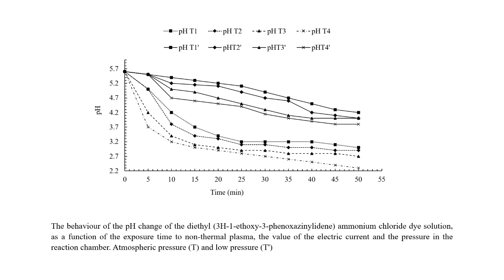The difference in the minimum pH value reached for treatments at atmospheric pressure and low pressure is attributed to three characteristic processes of the experimental system: processes of ionization and dissociation of water, aqueous solution of the contaminant of interest, stimulated by the increase in temperature due to each treatment; generation of new compounds due to the presence of air molecules in greater or lesser percentage inside the reaction chamber; as well as the presence of free electrons generated by the plasma.